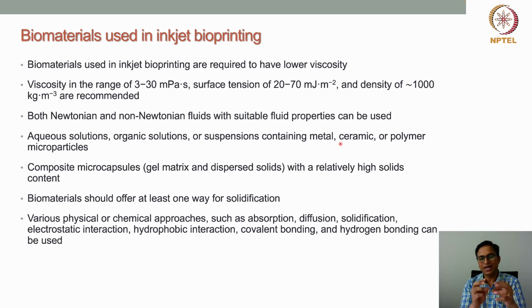But as soon as they come out of the nozzle and we deliver them to the printing stage or substrate, they should transform from the liquid phase into a solid, gel, or liquid-solid state. That capability should be there when a biomaterial formulation is used for inkjet bioprinting.